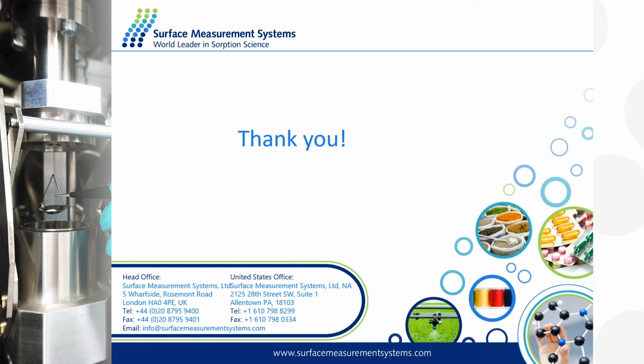So I have here one from Millie. Can the samples be remeasured? How much consistency or disparity is there if the sample has been measured again or multiple times? Do I need to worry about irreversible adsorption that damaged my samples?